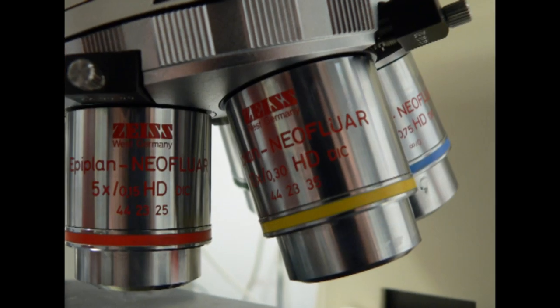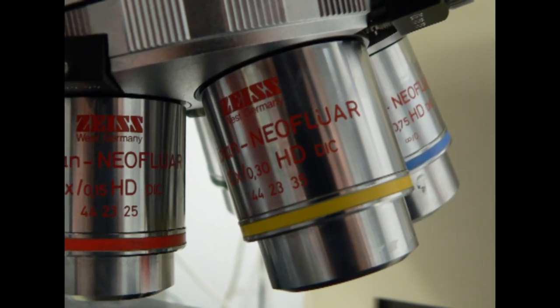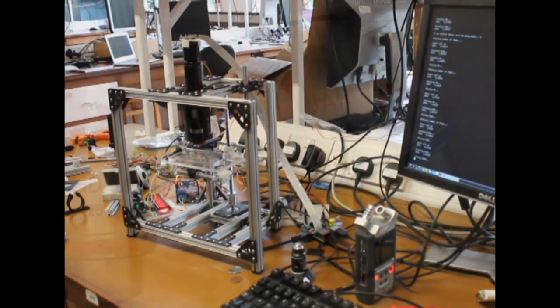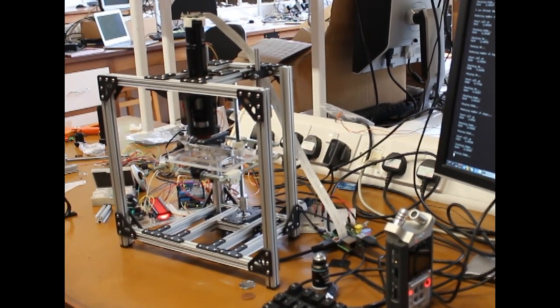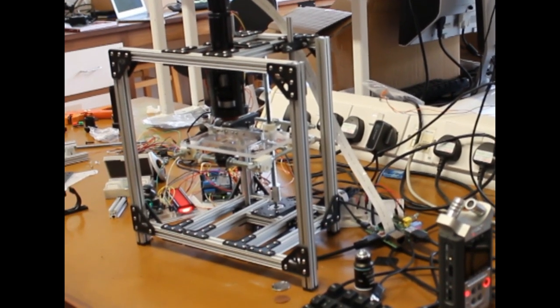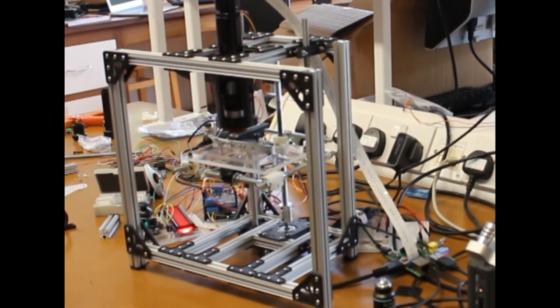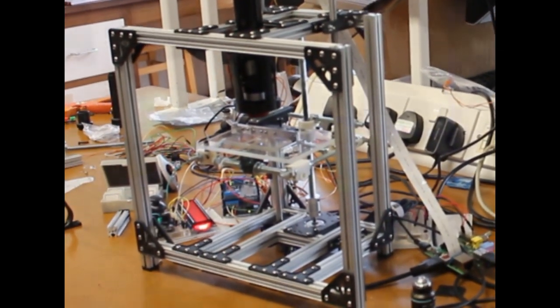One of the big problems with current microscopes is it's very expensive to buy all of the lenses and things that you need. So what I've been trying to do is buy very cheap lenses and put them together easily so that you can cheaply make a very high-quality microscope.